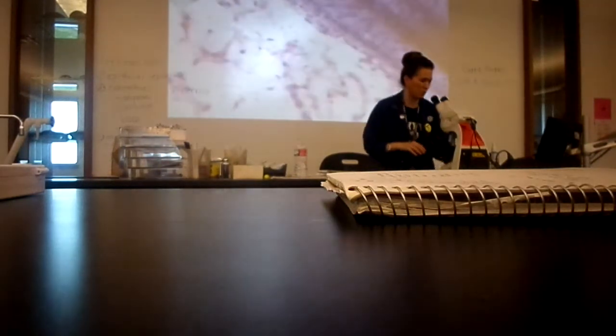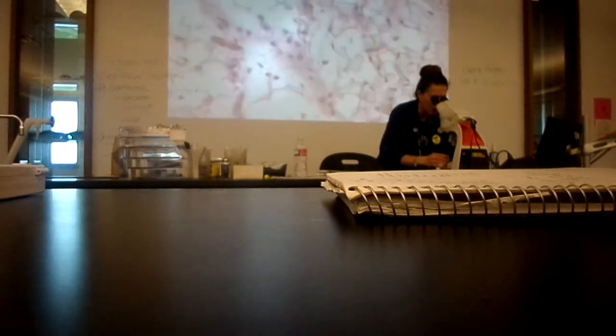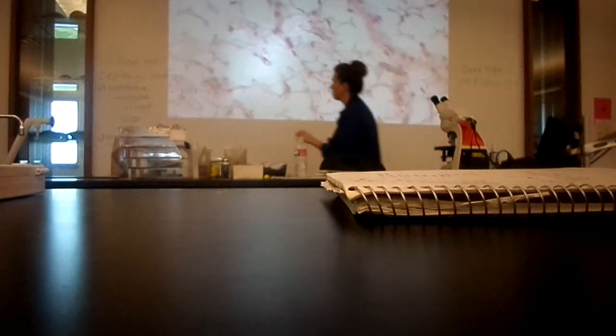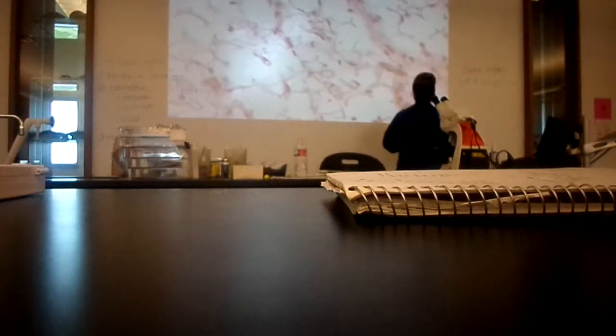What is adipose tissue? It's another name for fat. Those are what fat cells look like. Fat cells are kind of big and roundish. The way they cut the slide and the tissue, we didn't necessarily get complete cells. But here's a cell, and what you're seeing is the nucleus of that cell.